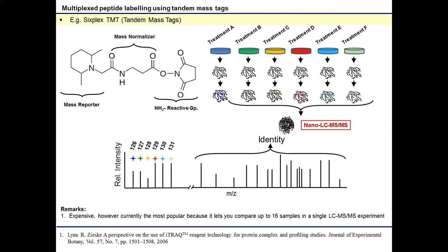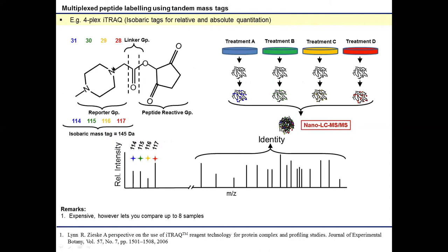It's similar to mixing and multiplexing in a flow cell by high throughput sequencing. So that's good to think of as kind of an analogy. And it is similar to that, but there is one key difference: using these multiplex reagents, since they all weigh exactly the same, Aruna called them isobaric. The reason for that is because of the isotopes. See if you can look at your screen. The carbons in that ring and the nitrogen will sometimes have isotopes, just a plus one Dalton isotope. And then in the balancer, the linker groups, you put other isotopes there so that everything has exactly the same mass.